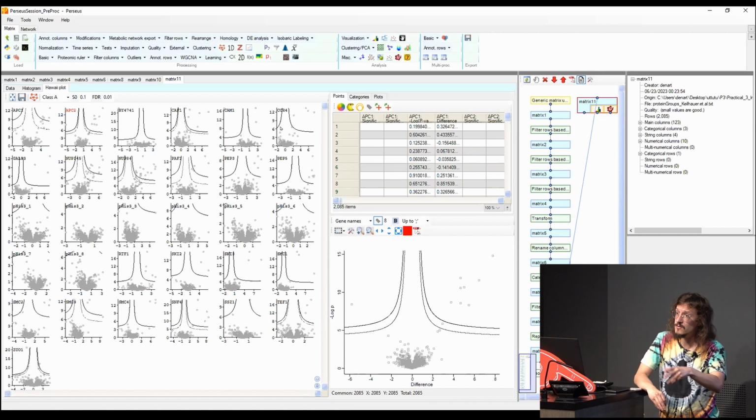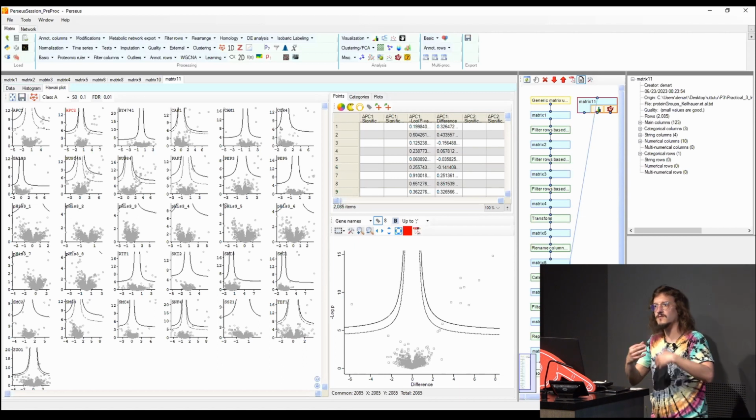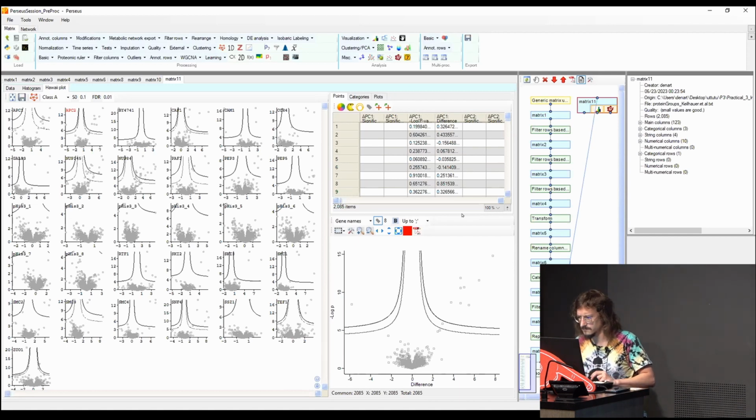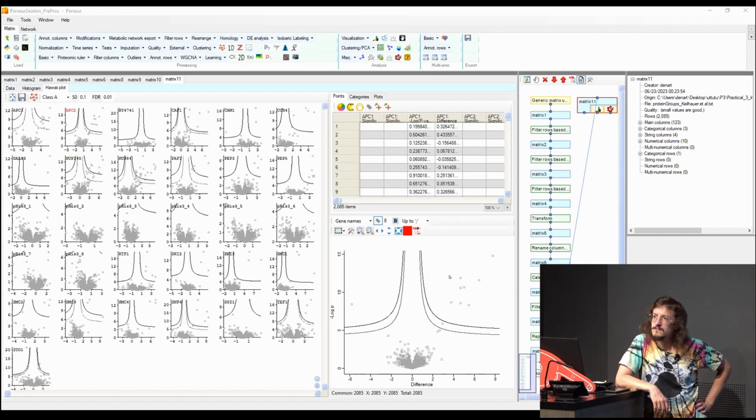The q-value is good when you want to find properly which things were really significant, when you use the FDR and you want to be really sure about the p-values that you get. I guess you could also do it with q-values, and then the curves would become horizontal lines in these kinds of plots. You could also do that.